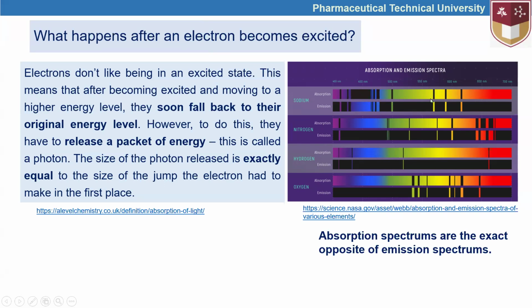Here we see only the visible spectrum, and ultraviolet from 200 to 400 nanometers is also included in UV spectroscopy. Some short ranges of the electromagnetic waves are absorbed. Here we can see the absorptions by different atoms as indicated. Based on that, it is possible to identify the atoms.